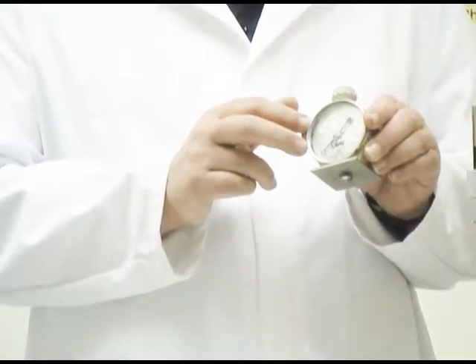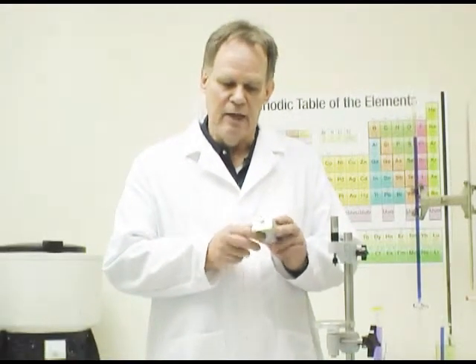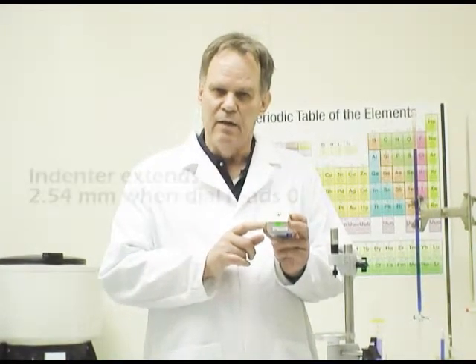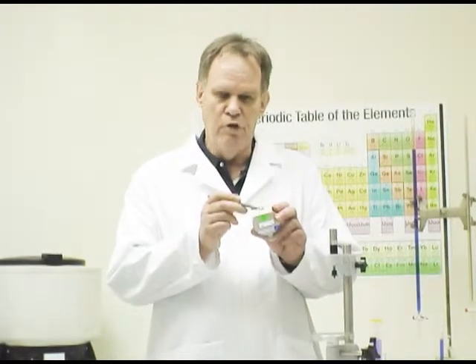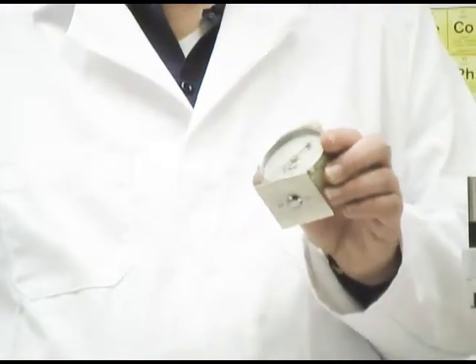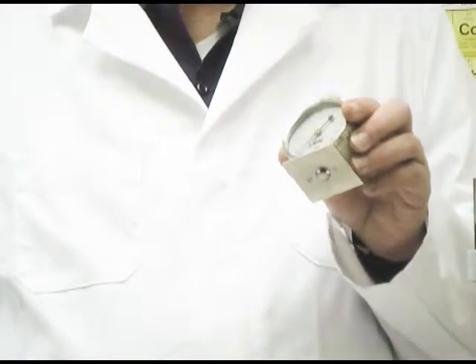All durometers have a scale that goes from 0 to 100. A reading of 0 indicates that the indenter — which in this case is a half-rounded little disc — is fully extended with no force on it, so the dial should read 0. If the indenter was fully pushed in so it was level with the plate, the reading on the durometer would be 100, indicating the durometer has reached its maximum force.